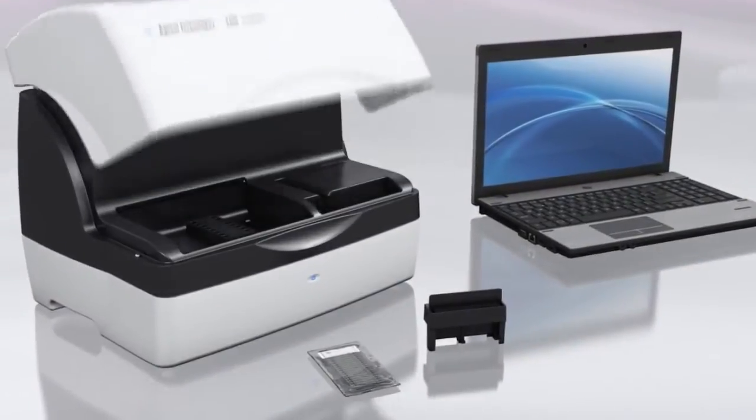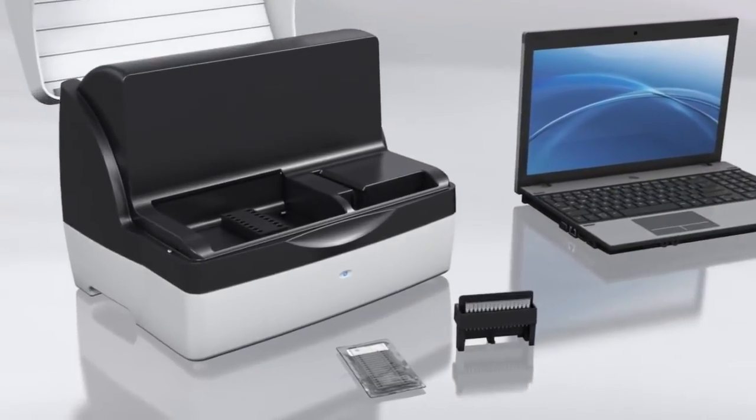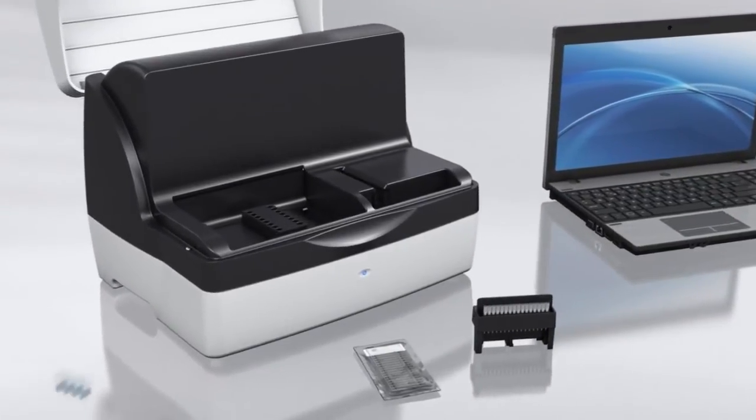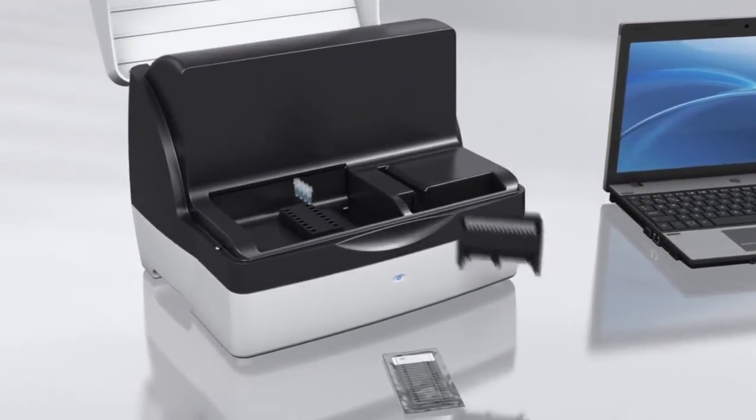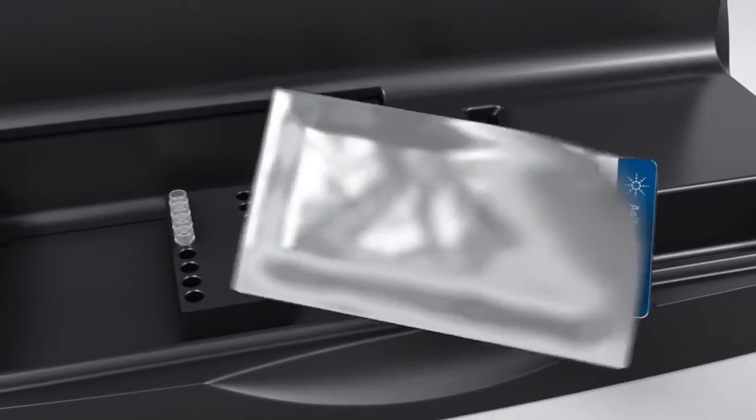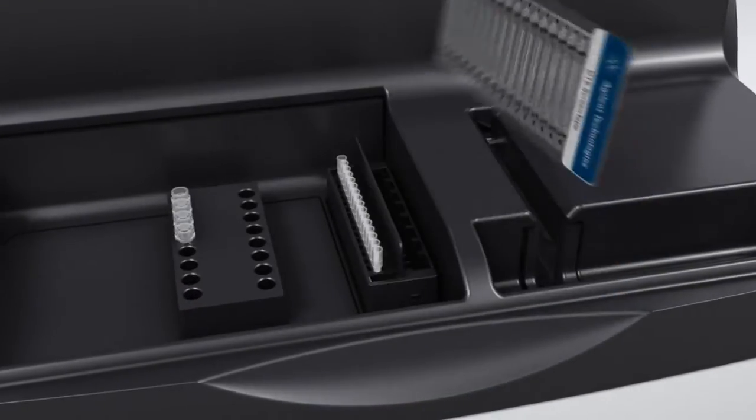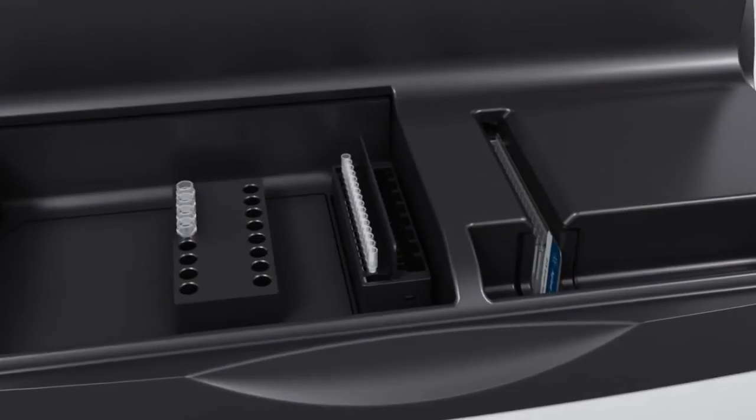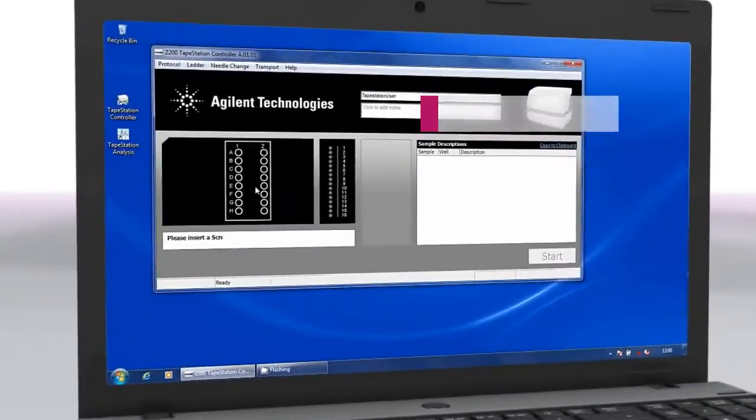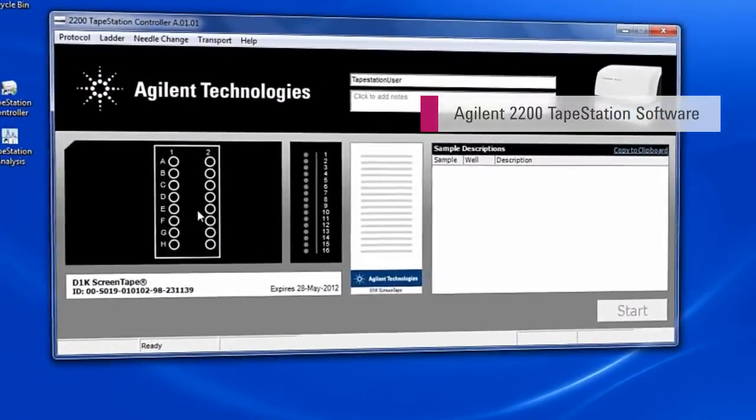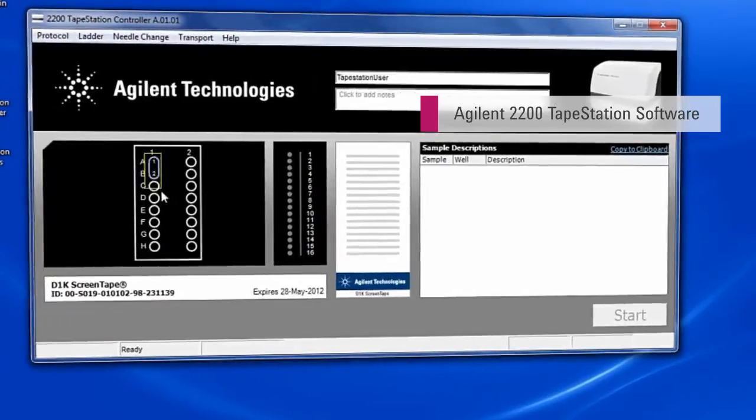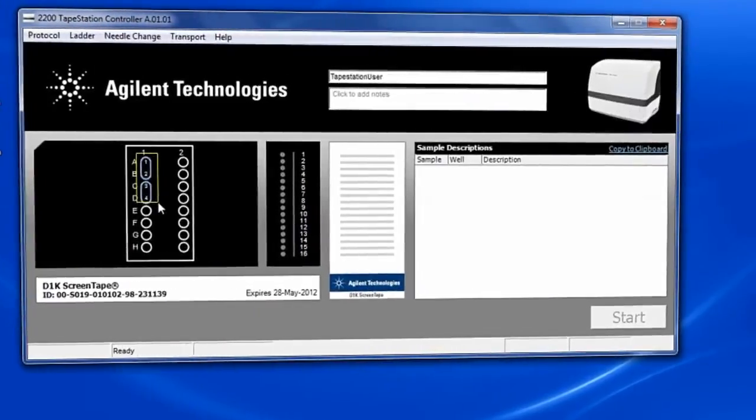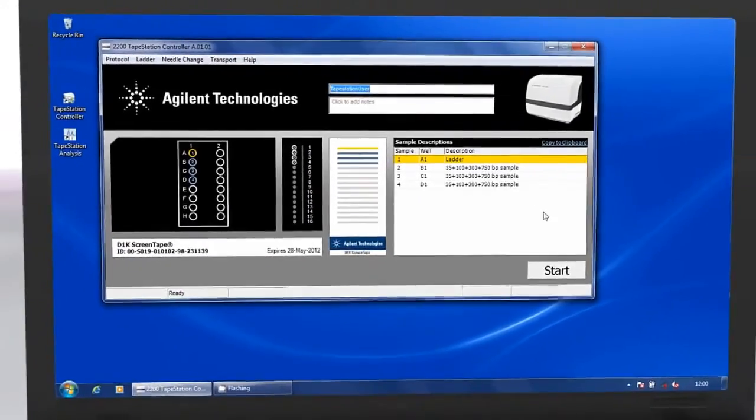Using the Agilent 2200 tape station is as easy as 1-2-3. Load the samples, loading tips and screen tape, and results are available in approximately 1 minute per sample. Barcodes on the screen tape provide automatic recognition of sample type and protocol, making setup straightforward.